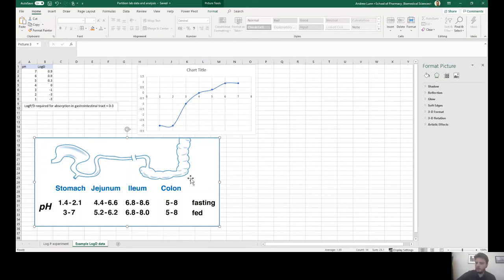So you started out just doing a log P experiment where we've taken a known drug, trimethoprim, and seen how it partitions itself across DCM and water. Now, more typically, we might use octanol, but we've used DCM in this case. Then we've made a calibration curve to determine the concentration in each phase. And with those different concentrations, we've been able to determine the log P, which is 0.9 something.